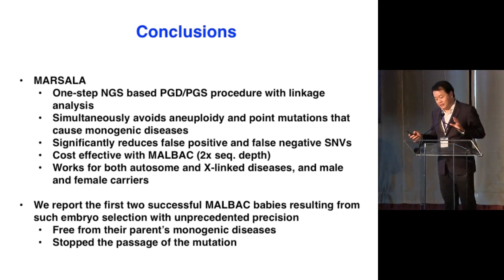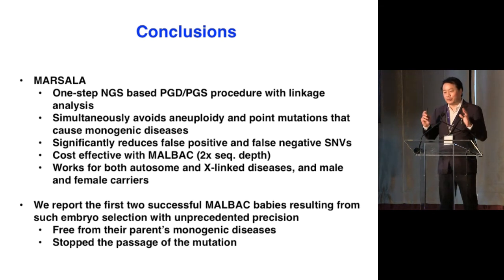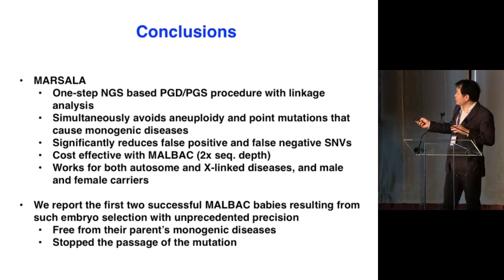Why is that? Now, I don't know if this will still be true for LIANTI, but MALBAC did have residual sequence dependence, so it amplifies certain regions reproducibly higher than other regions. So because of that, we could do relatively shallow sequencing, 2X, so that's not too expensive.